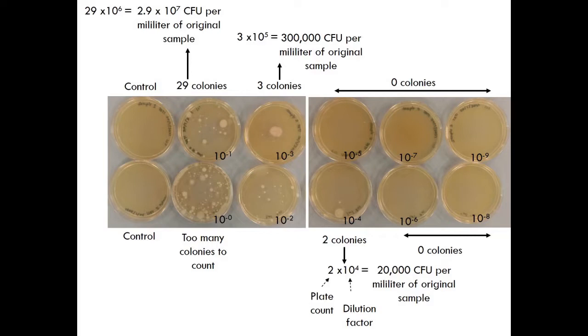The colonies obtained in these plates can be used for further physiological characterization. For an example, the bacterial growth profile, which could help to identify when is the best condition to start a treatment process using bacteria.